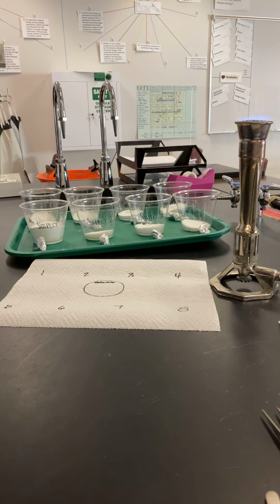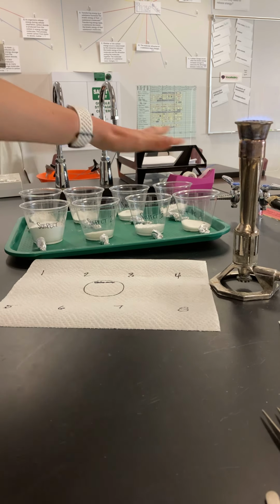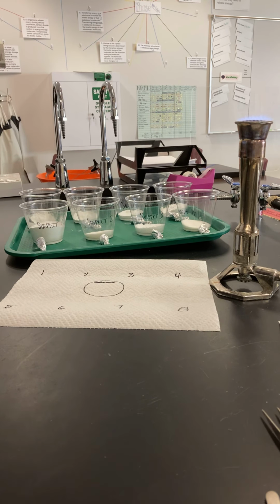So what I have for you guys is obviously my 8 suspects on this tray. All my little melting cones are all loaded up and ready to go, so that should be quick for you guys. But what's really hard about it is when I melt these, first of all, remember that if they melt really quick, they have a low melting point, okay? We've talked a lot about energy added to a substance and how that changes the molecular freedom of movement of the molecules of that substance.